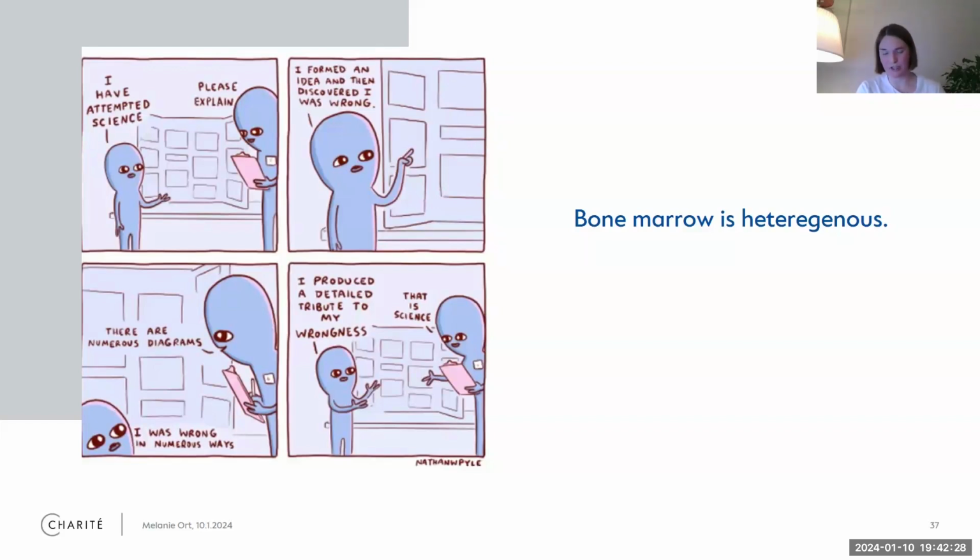So every time I ask a question, hey, have you seen this in human bone marrow? They're like, we don't go that deep into that tissue. So I actually went back, and I could fill another whole talk. I went back to the clinic, asking my colleagues for more bone marrow samples, working with the core unit, trying to figure out what is natural heterogeneity between patients and what is an observation that I have in vitro or in my 2D or 3D culture.